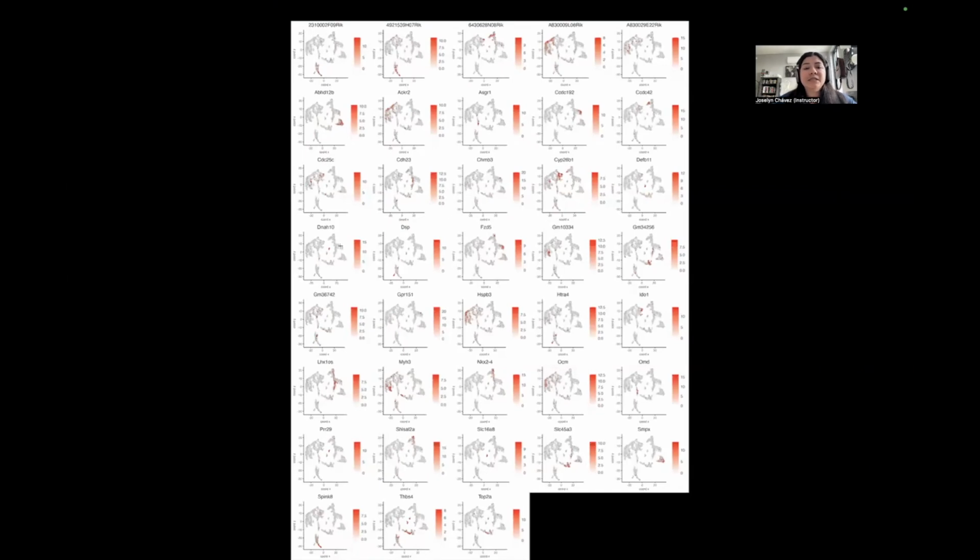So basically the difference, as I was saying before, is that in this case, we are observing not the spatial distribution. We are using one of the dimension reduction plots for plotting the distribution of the expression. In this case, it is the scaled expression of each of these genes. So, for example, I believe this is the UMAP, if I remember well. So basically, in the UMAP context, how does the expression look on different spots or cells for each of these genes?